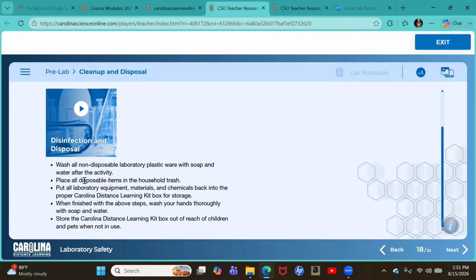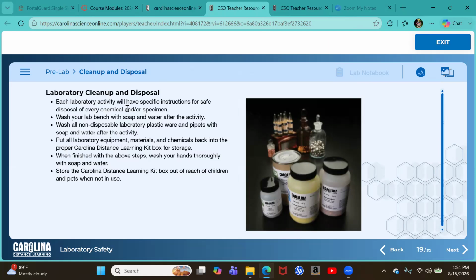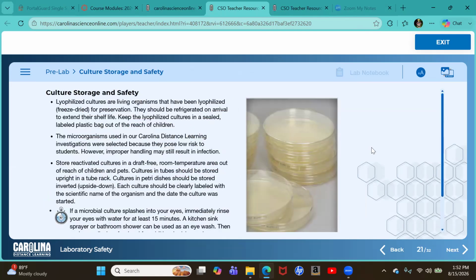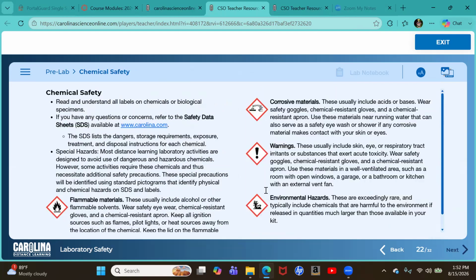When you are finished with your lab, obviously, we will talk about putting everything back in the plastic bag that it comes in, disposing of it properly in your trash can, and wiping down the surface. So, checkpoint question 6 here. Each lab is going to have its own individual specific cleanup. And when we do the lab through Carolina Biological, it will give you that specific lab's cleanup and breakdown structure.